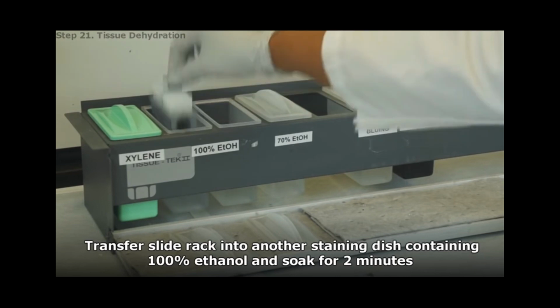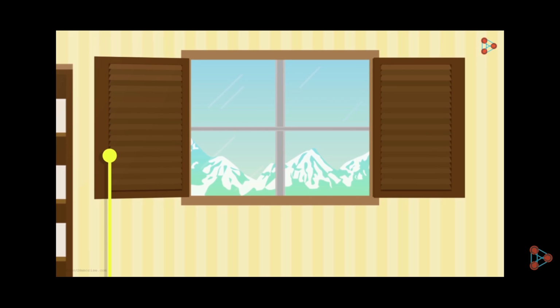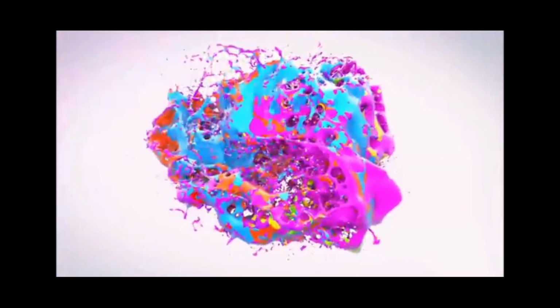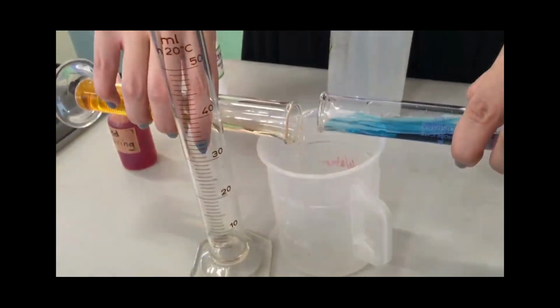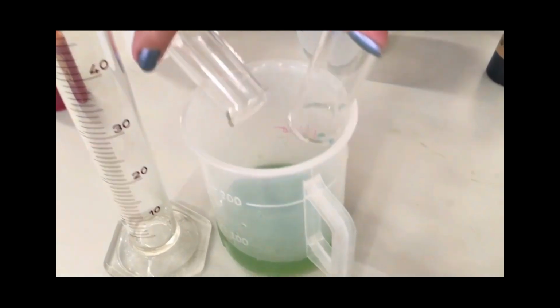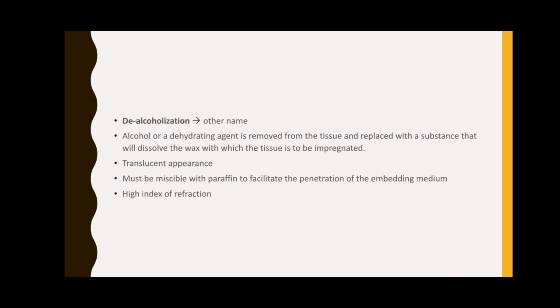When the dehydrating agent has been entirely replaced by the solvent, the tissue has a translucent appearance, hence the use of the term clearing agent. Few dehydrating agents are miscible with paraffin wax. When used after alcohol dehydration, the clearing agent serves to mix with alcohol and removes it from the tissue. It should be miscible also with paraffin in order to facilitate the penetration of this embedding medium.